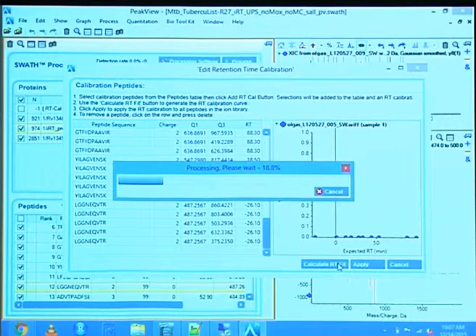So you don't need that value to identify them. And you can check if the retention time is okay, since you have the library and you know at which time it should elute. Like this, you can easily define your own peptides, make your own protein, or retention time protein.